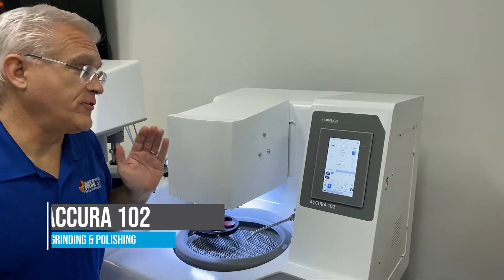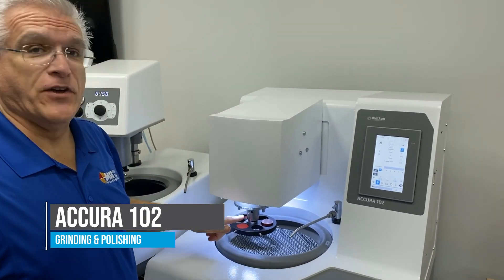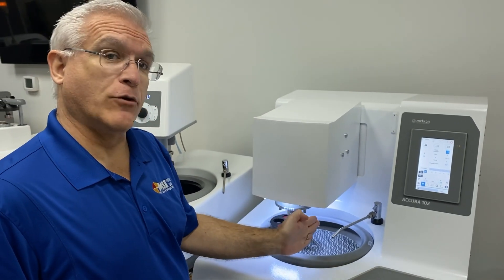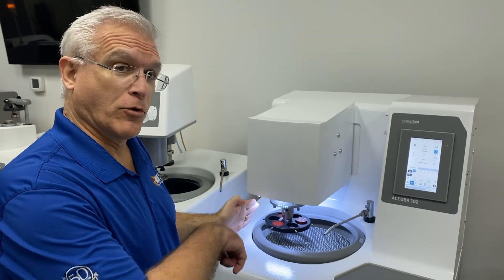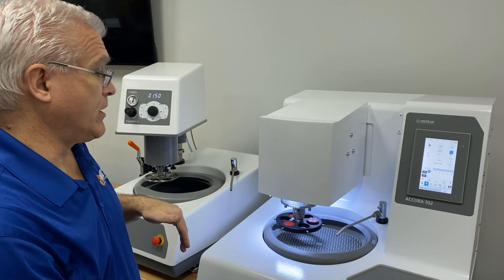This is a very precise two-column polisher that uses central force or individual force for polishing, plus it has lateral polishing capabilities in addition to the normal rotating polishing and abrasive base.